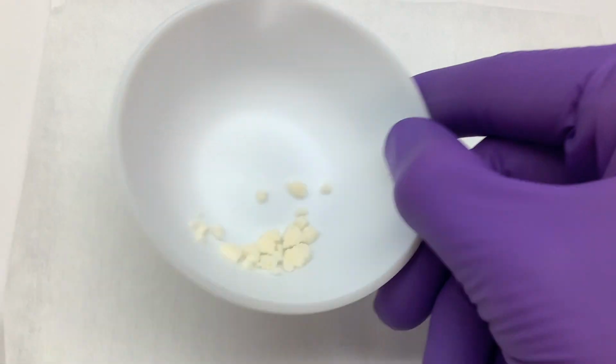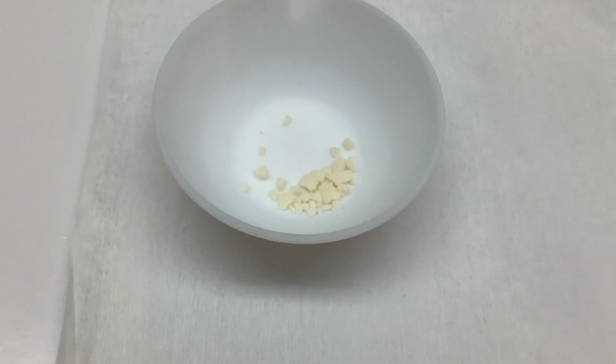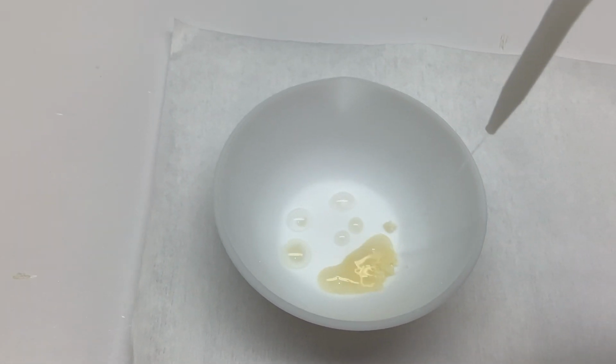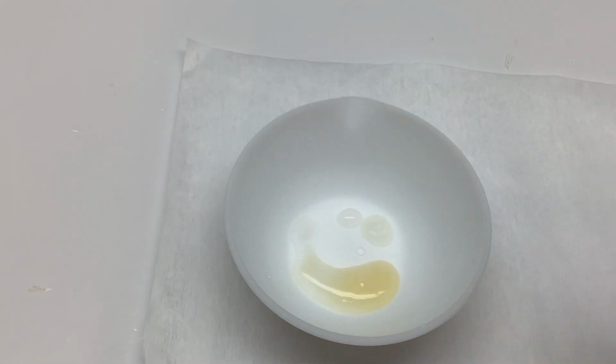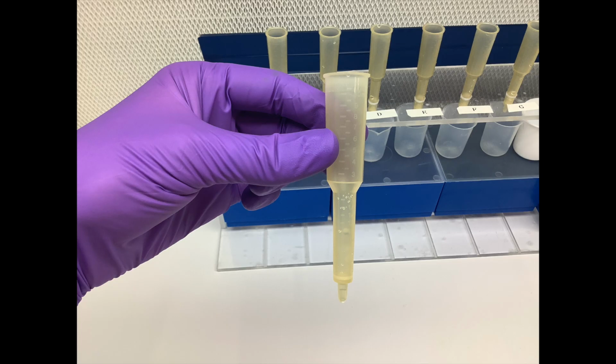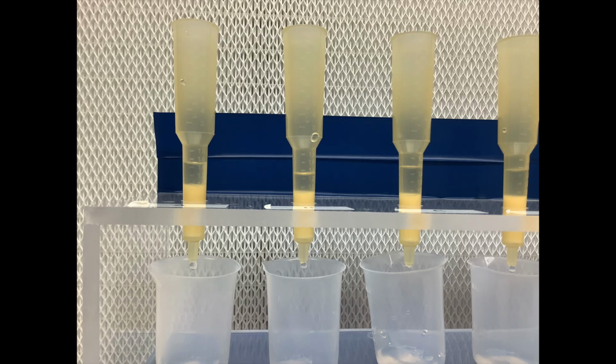First, let's meet the resin, an organic compound coated over small plastic beads. These fine beads are readily suspended in water and loaded into the column. The column is a simple tube with a filter at the base that allows fluid to pass through but prevents the resin from exiting the column.